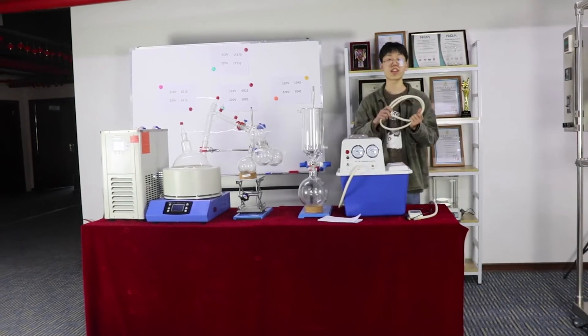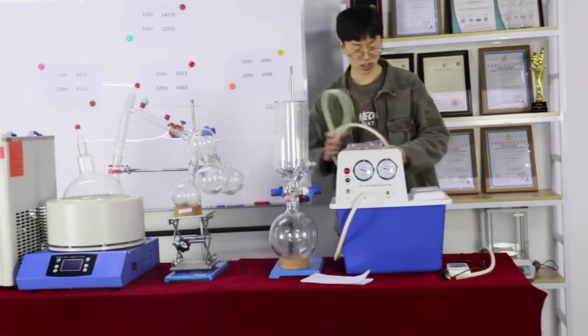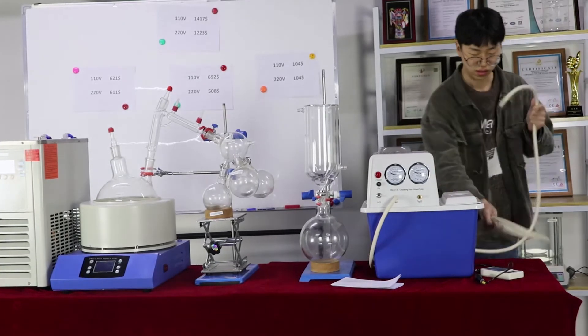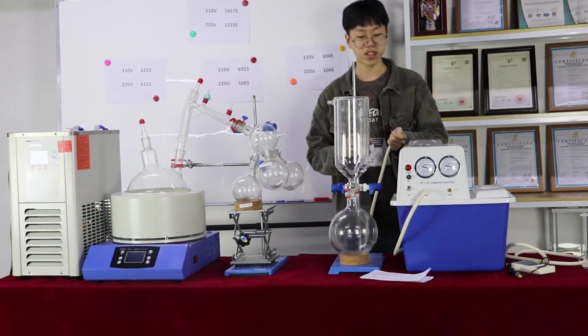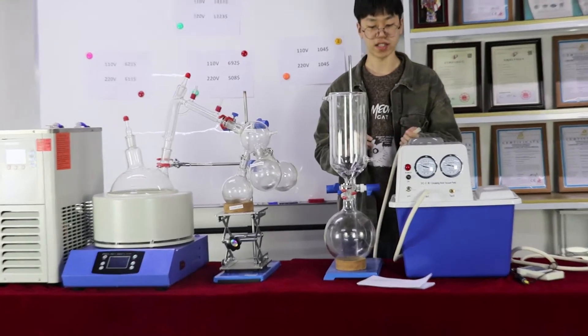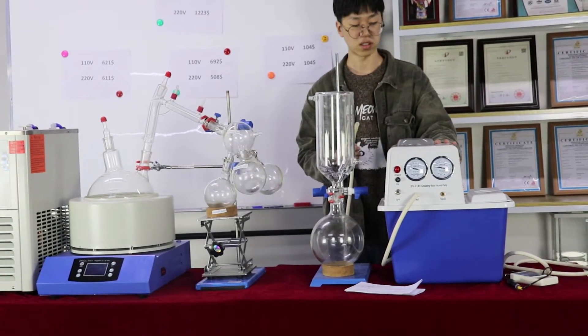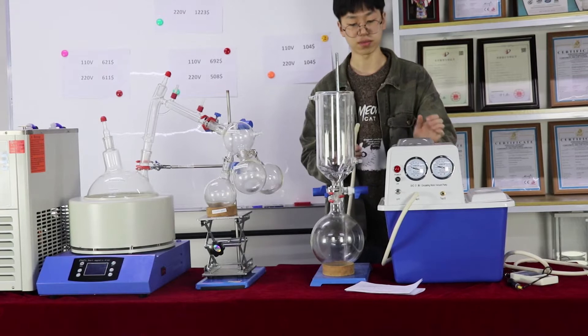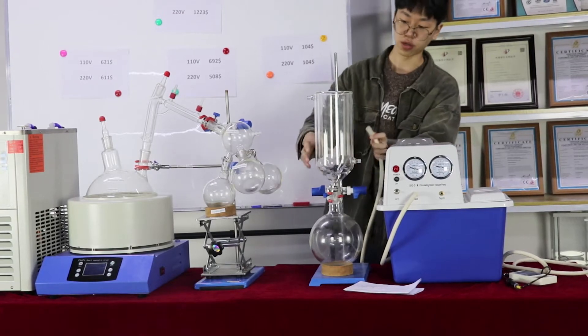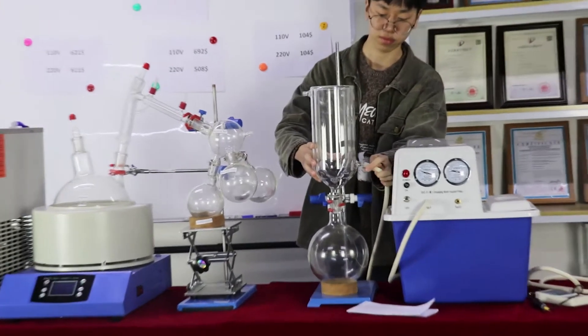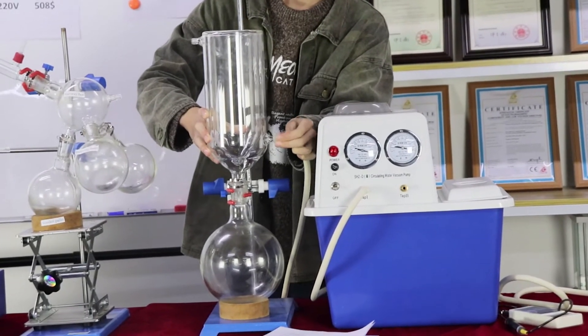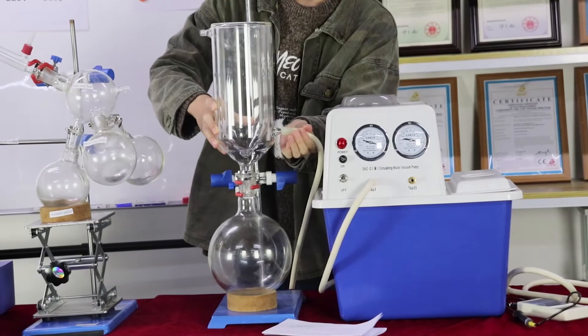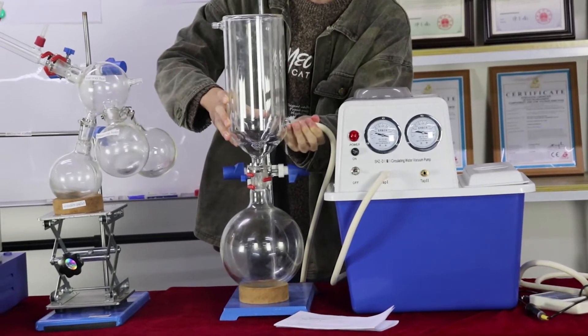This is the vacuum tube. First, I need to connect the circulating water vacuum pump to the cold trap. It needs to lock out.